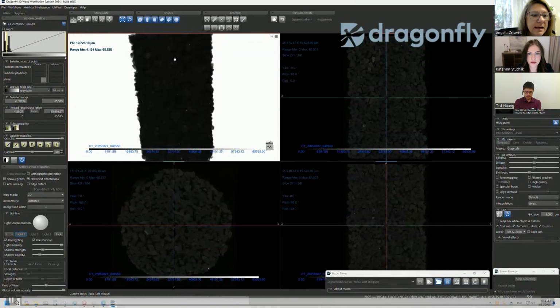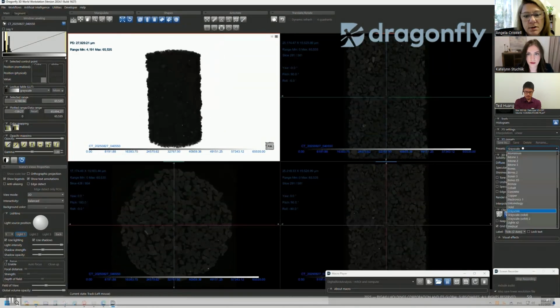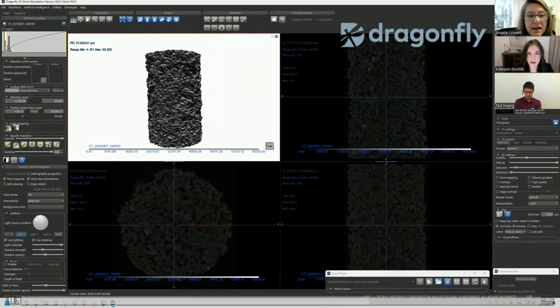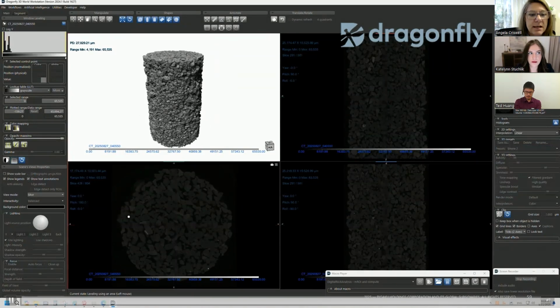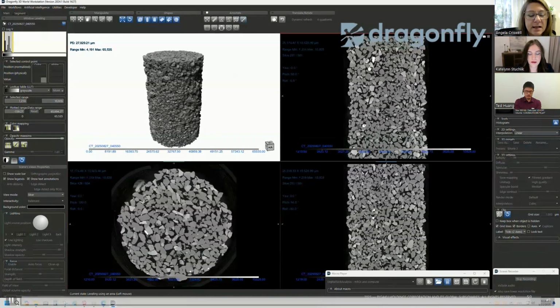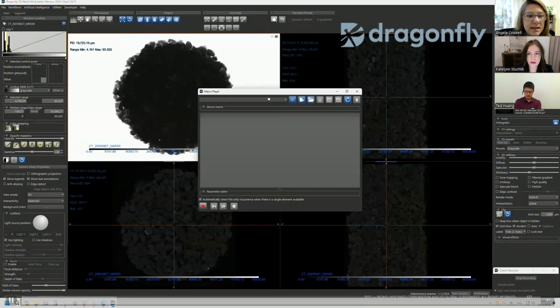And then I'm going to manipulate the interface in the sample view so that I get it to look exactly like I want. And in this case, I may want to save some 2D and 3D images, and all of the steps that we're doing here to adjust the 3D rendering, as well as the contrast, like here, is being recorded as we record this particular macro. And so I went on to add the additional steps and eventually stop recording, and I ended up with a macro.